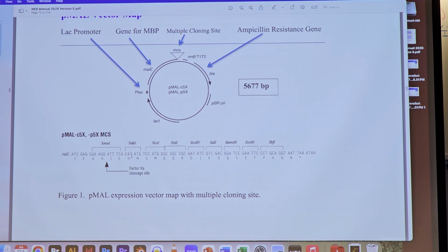It's shown divided into codons so that we can see how this gets translated into protein. If you don't insert anything in here, then you get this sequence of amino acids, which doesn't code for anything, and then you just have a stop codon here. You see that's TAA, which is UAA in the RNA, right? So if you don't put anything in here, you would stop at that point. That's where your protein would terminate.